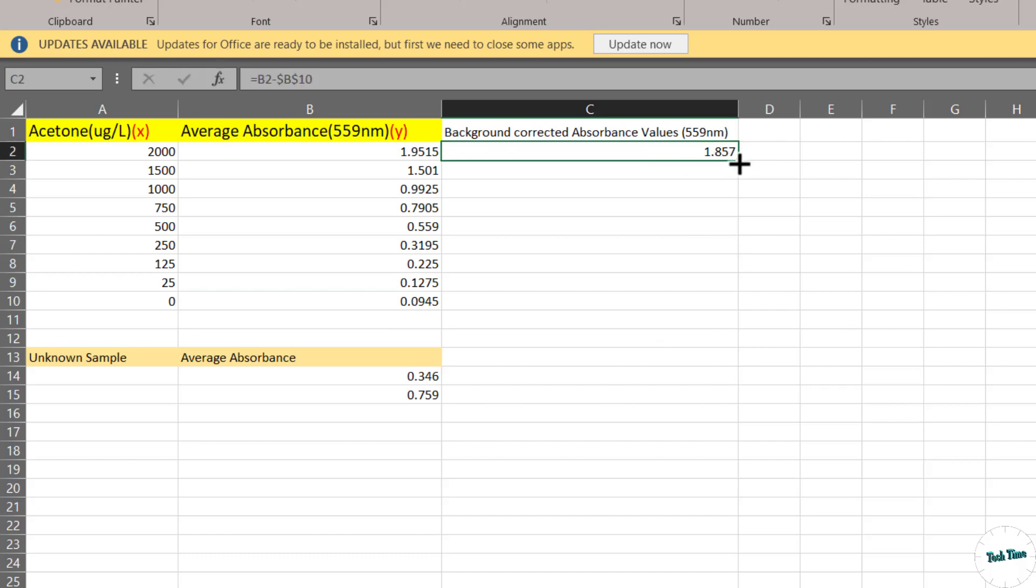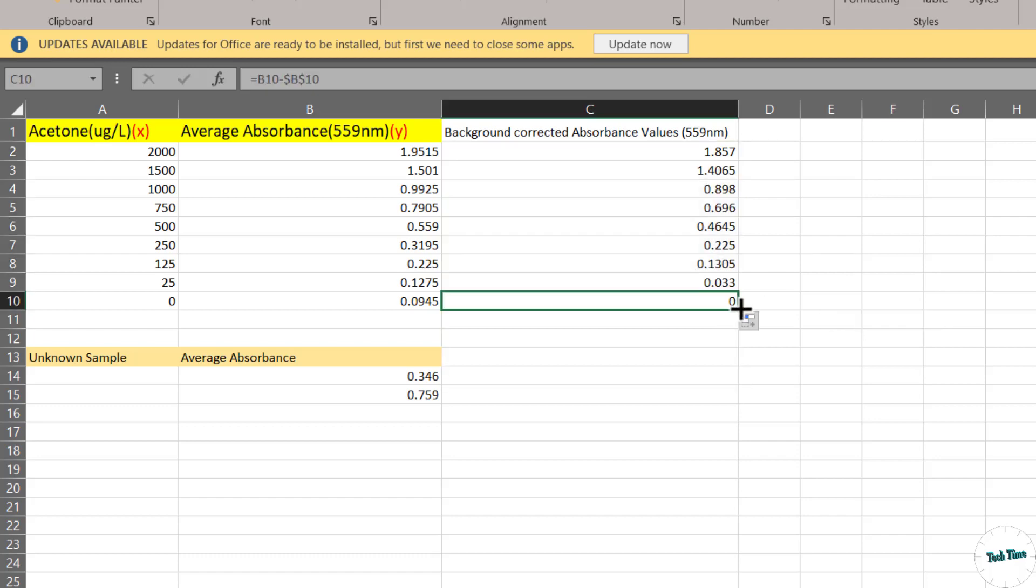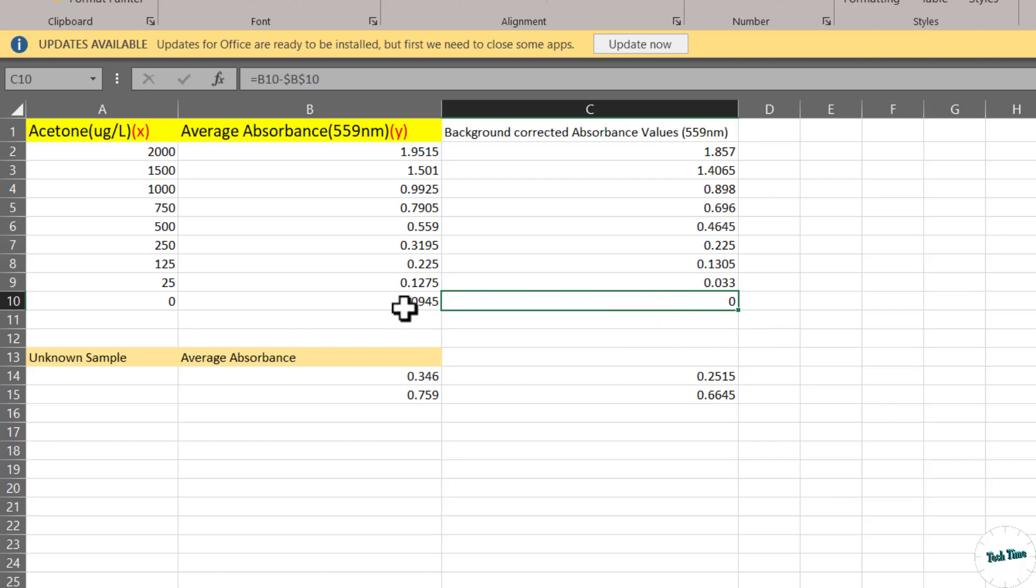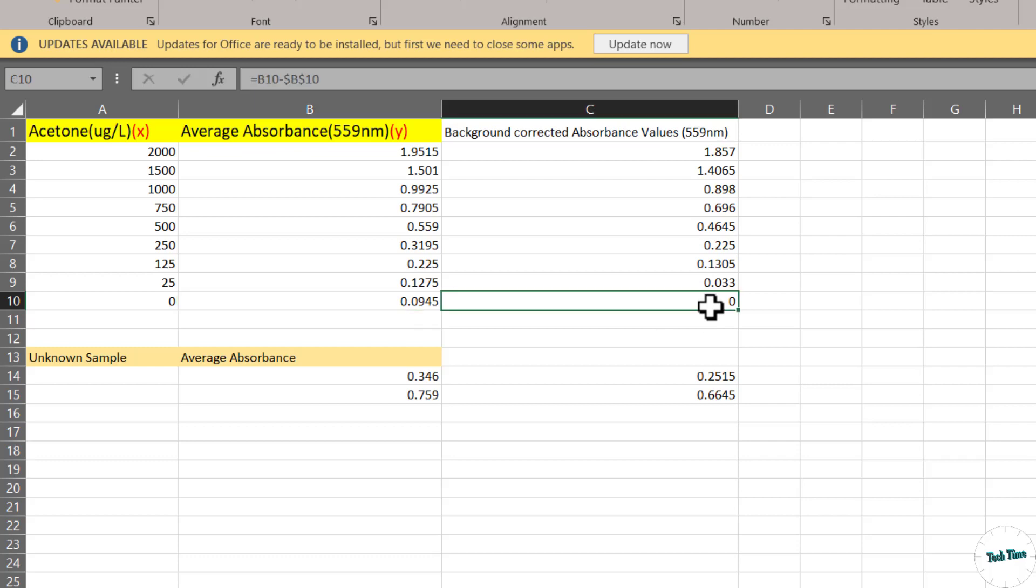Now you can simply hold this green square and drag it down to make all the necessary corrections. Let's extend this to these two values as well. Right over here you can see we've got zero. This is simply because we're subtracting this particular value from the same value. If you don't get zero right over here, this means you've made some mistake.